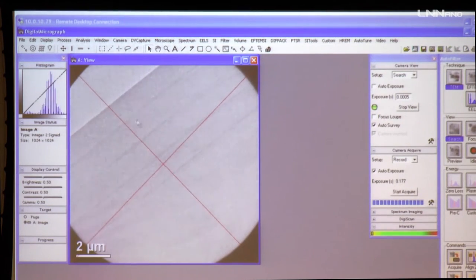As silicon germanium has a higher concentration, it appears darker in the image. So 1, 2, 3, 4, 5, it's a five set. These are the multi-layers of silicon and silicon germanium, and normally this sample is used for calibrating the TEM, magnification calibration.